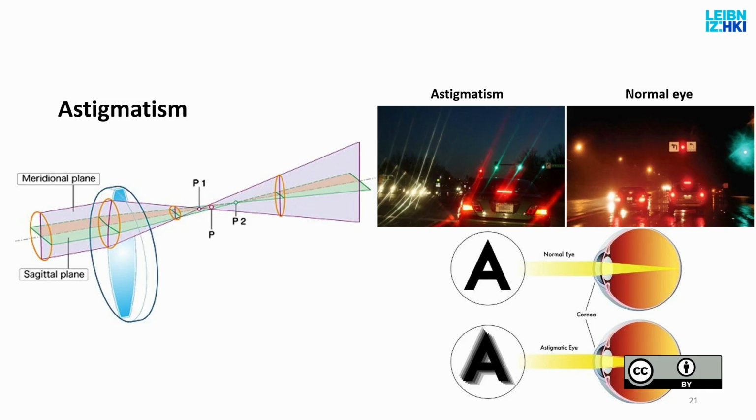Very briefly, just as background, you know that light is basically an electromagnetic wave. We talked about it as a beam so far, but as an electromagnetic beam, it has a certain polarization angle. And the polarization angle determines the diffractiveness.